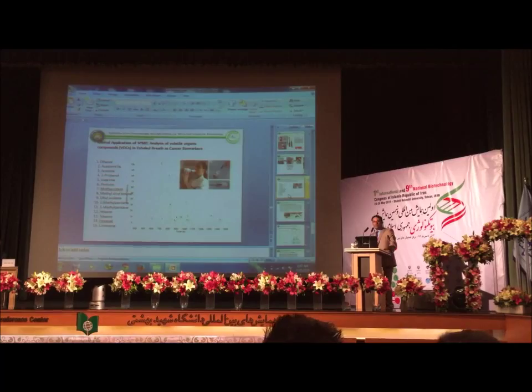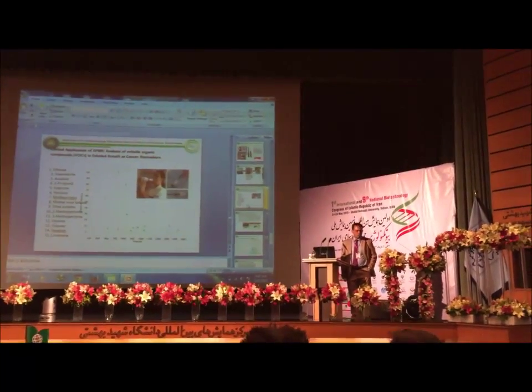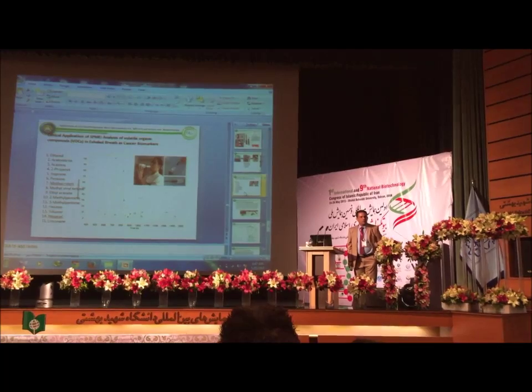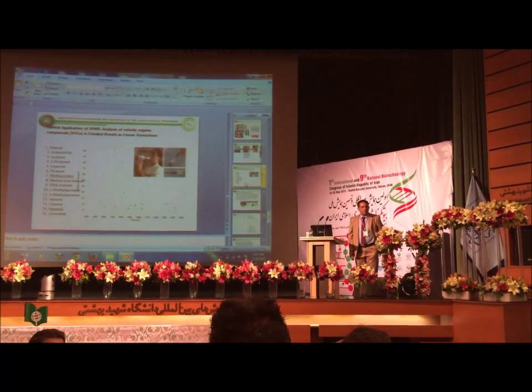Is there any difference between using solid phase micro extraction and using hydrodistillation for essential oil?